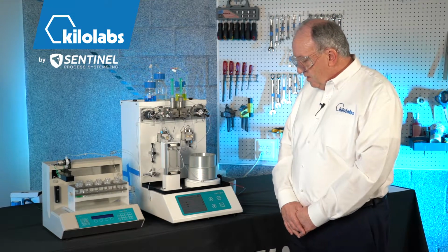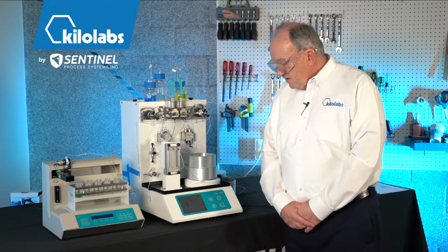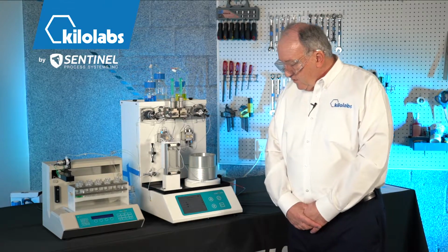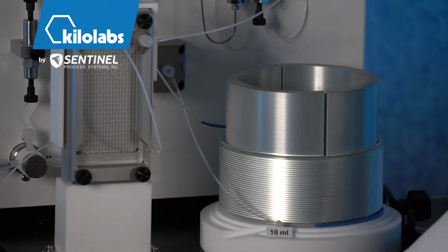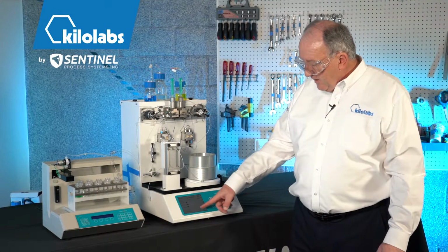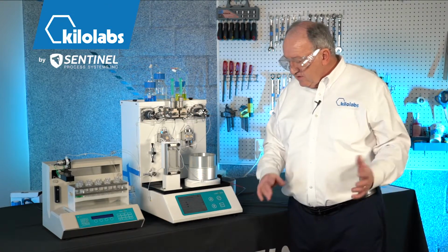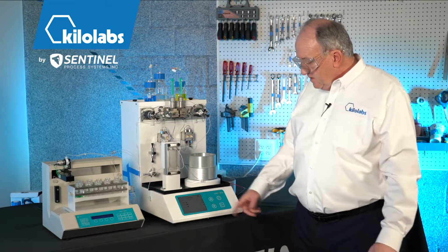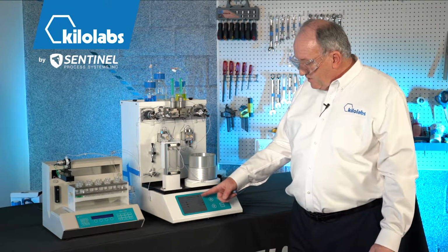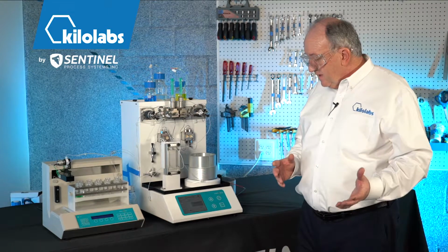Now it's coming up to equilibrium, and when the temperature gets within 2 degrees C of the desired temperature, we'll go through a starting sequence. We've got just a few more tenths of a degree to come up. Now we're within 2 degrees C of the new reaction temperature, and we get an auto start sequence. That's the beep you hear saying get ready, we're going to start the second experiment. There's a countdown for that. Temperatures are coming up a little more because we set them at 26. And now we've started the second experiment.